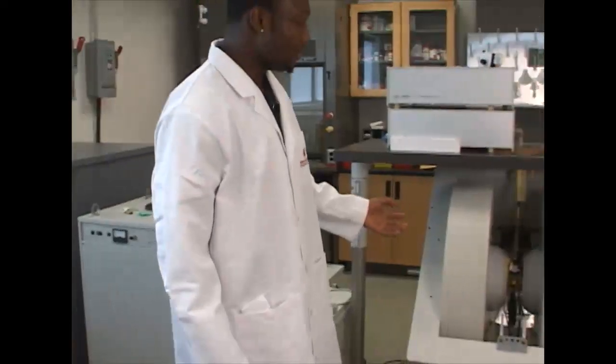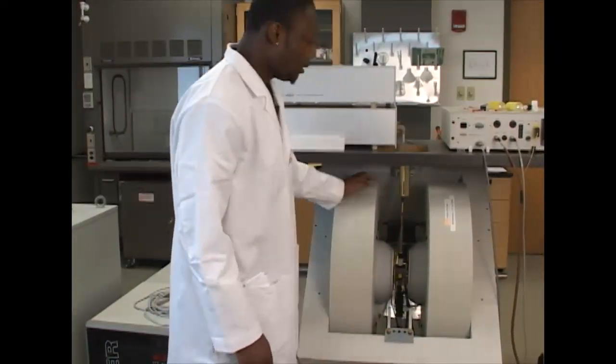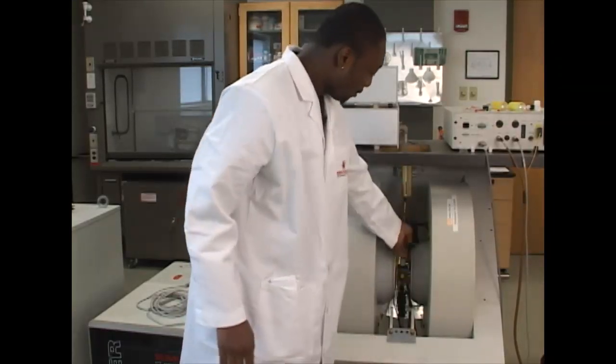What we have here is our sample cavity. We have two bar magnets and this is the cavity that our sample goes in.